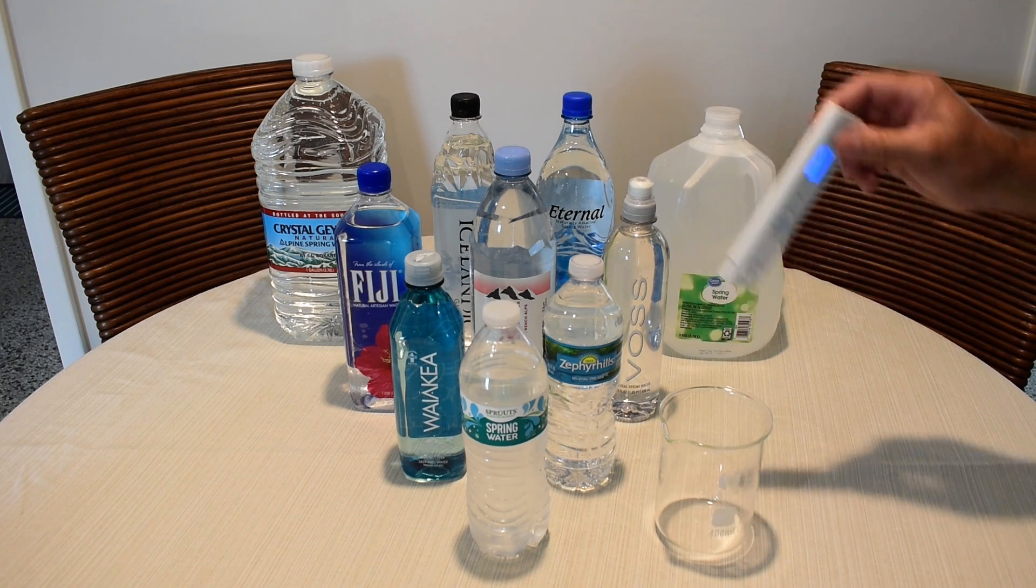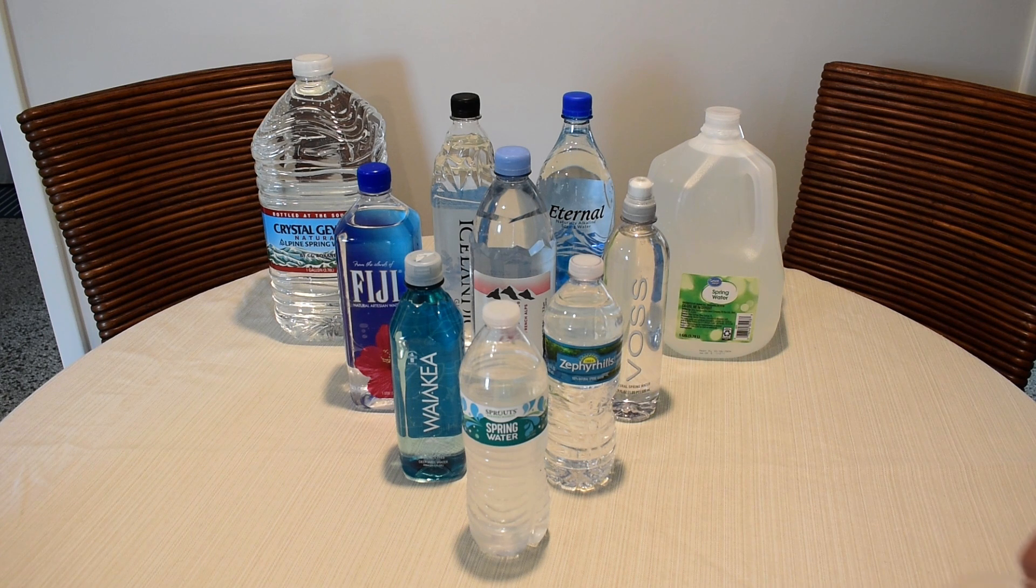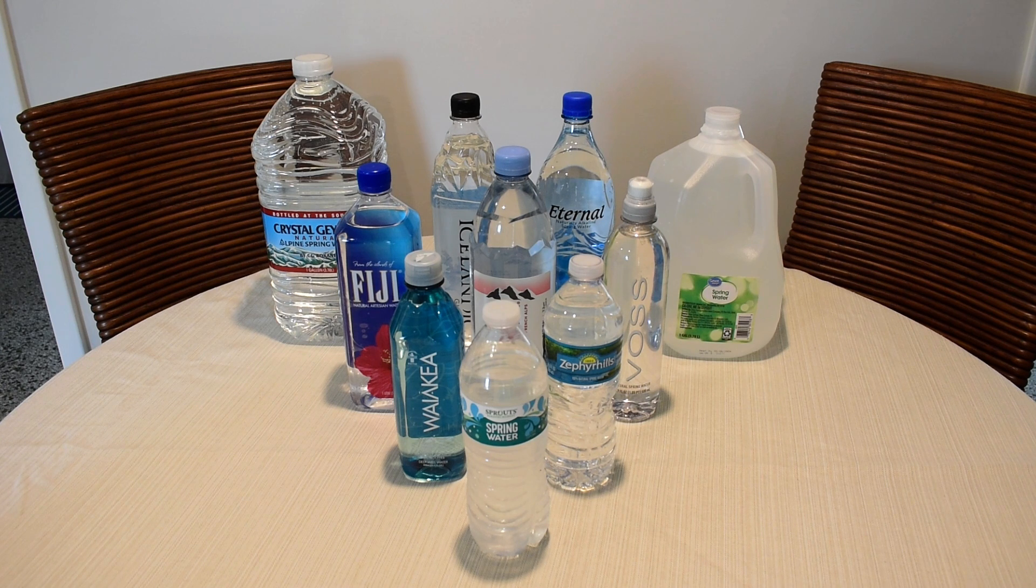But before I test each one of these different brands of drinking water, first let's take a reading of the tap water in my house, and then the water that's going through a GE carbon block, it's around 50 bucks from Home Depot, to see what the difference is between the tap water in my house and the water that's filtered using the GE filter.